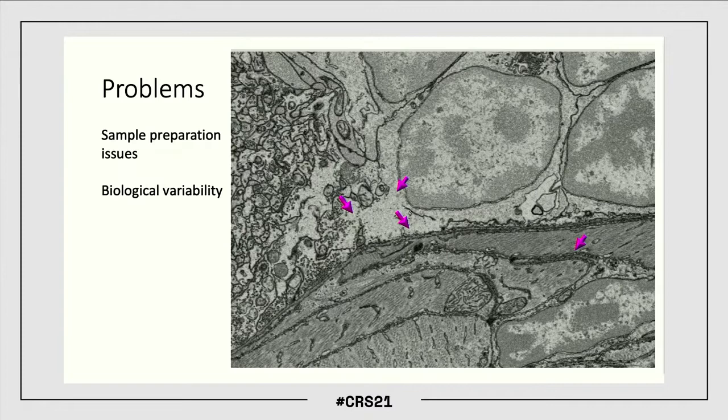Another problem is that especially in a very large sample, like if you're doing whole organism imaging or tissue imaging, then there is a lot of biological variability. So all these cells are of different types. They all look different. Their membranes also look kind of different. And that's a problem because if you want to predict these boundaries, and we are following the regular, totally normal supervised machine learning paradigm, you need a lot of training data to actually represent all this variability. And we can't be like the natural image people who would say, well, there is ImageNet, we'll pre-train everything, we'll have a backbone.